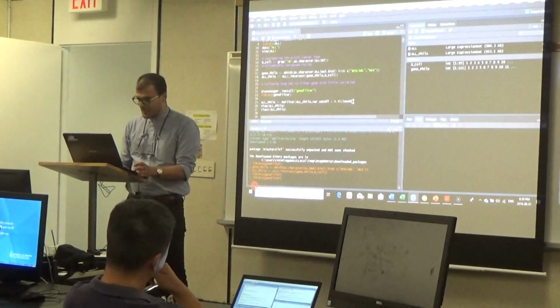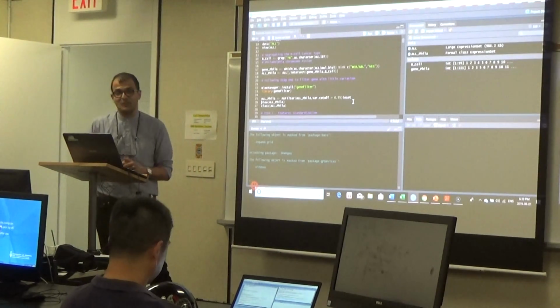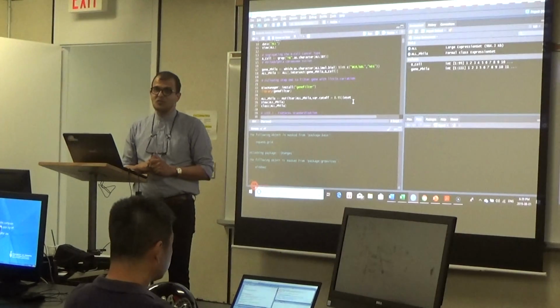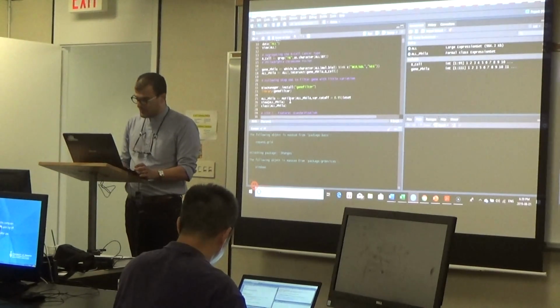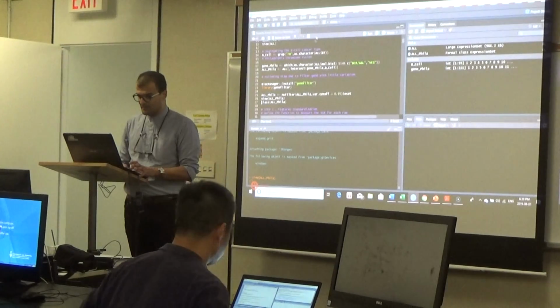I'm just going to click and enter. And now I'm so glad that it works. Sometimes working with Bioconductor is so challenging. The function which used to work 2 minutes ago, it stops working. Okay. And now you can just take a look into the data sets by the view.